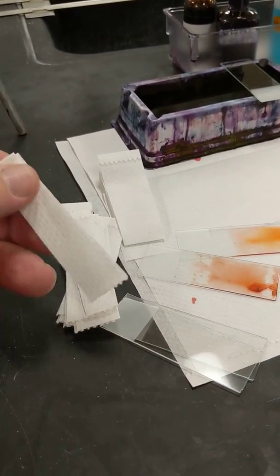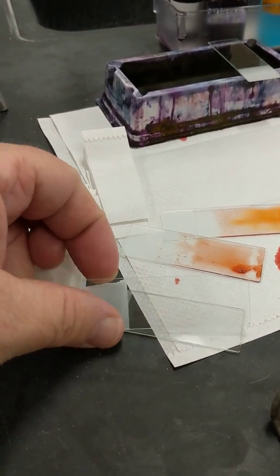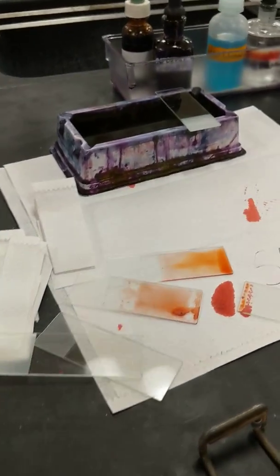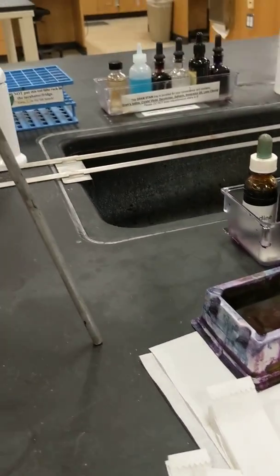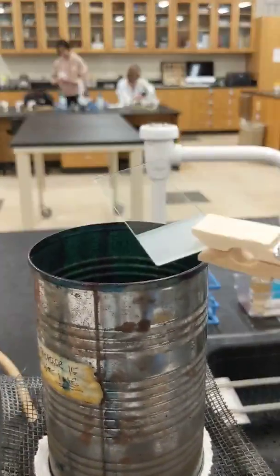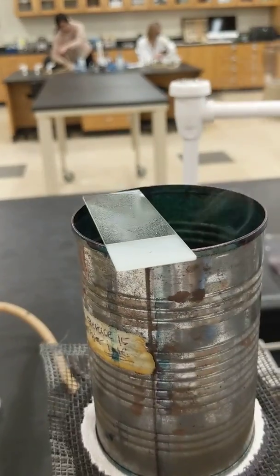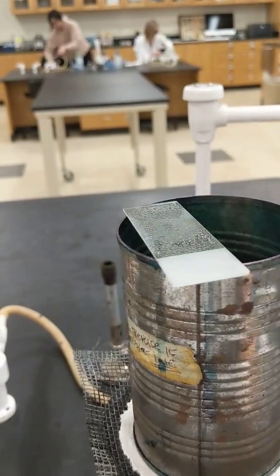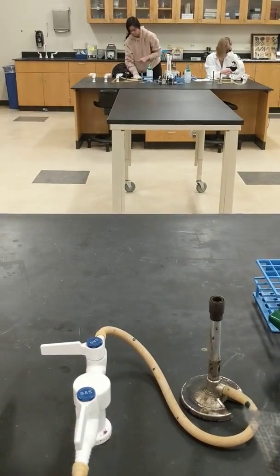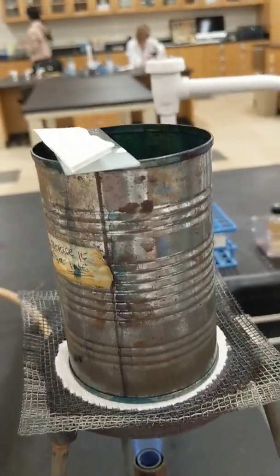The difference between the acid fast and the spore stain, what I'm going to show you, is that I made these pieces of paper that slide a little bit here. What you're going to do with that one is take your slide, and this will be kind of hot, so what I'd recommend is that you have a steaming cup here, and you put your slide on there and see how the steam goes on that slide. You can then put a piece of paper up on the top, and then here's your carbofuchsin.